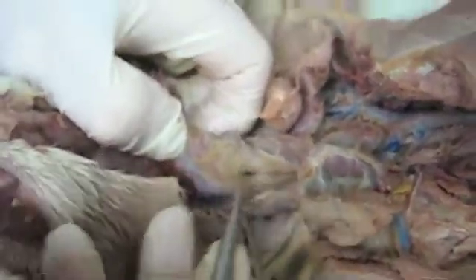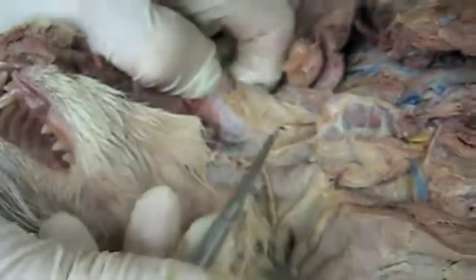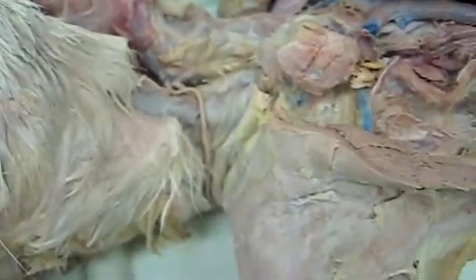Esophagus is going to be down here underneath the trachea because the... cut those strings. So yeah, I mean, because the trachea is, the larynx is right in here, and then we go down to the trachea, and then this tissue that's just deep is going to be the esophagus. So it's right up against the trachea on the dorsal side. There's still the cartilages of the larynx.